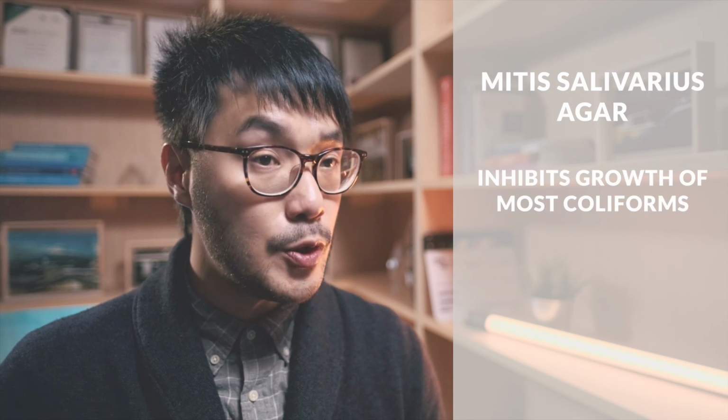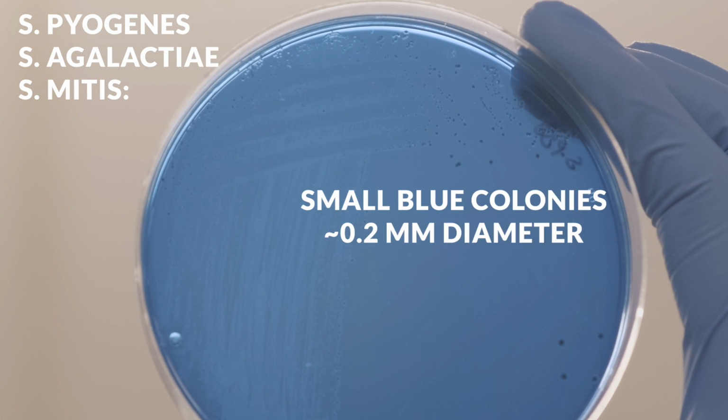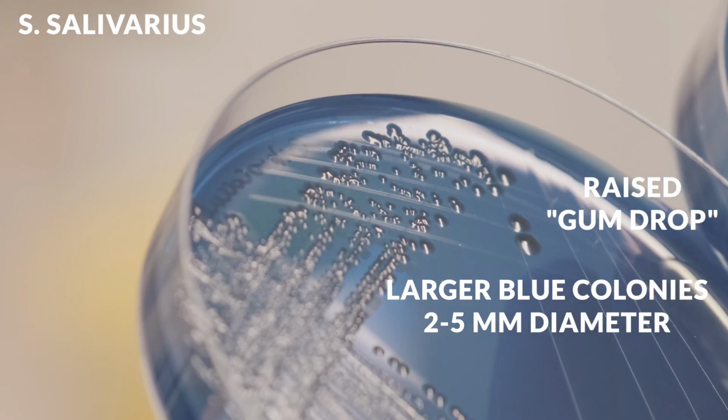Mitis Salivarius agar is a selective and differential medium that is inhibitory to most coliforms and selective for Streptococci. Strep pyogenes, Strep agalactiae, and Strep mitis all form small blue colonies about 0.2 mm in diameter. Strep Salivarius produces larger blue colonies 2 to 5 mm in diameter and with a raised gumdrop appearance.